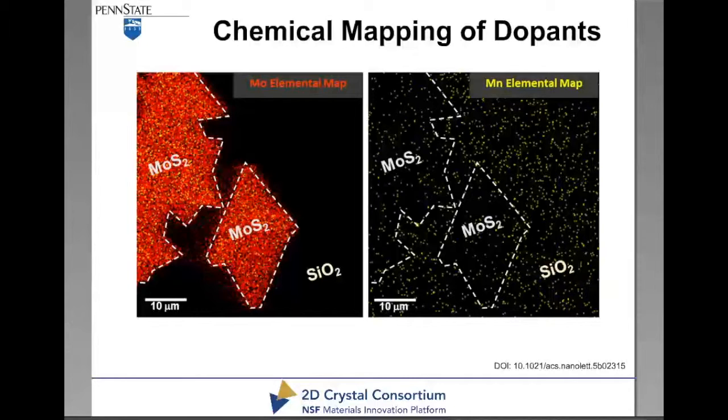The problem with it is when you get into things like surface roughness. So basically, you just want to look at the bottom here, where we've got region A and B on the bottom left, and then we've got this interface, right? If it turns out that that's truly the region, it'll actually suggest that there's true intermixing as opposed to just surface roughness. It's very hard to tell the difference between those. So that's something to take into consideration as a part of the analysis process. But if you do it right, you can actually get a lot of really neat information from that.